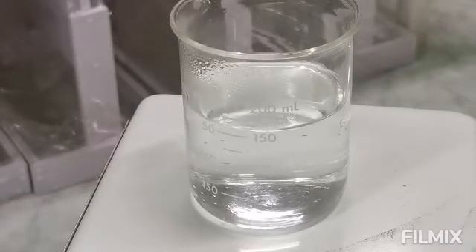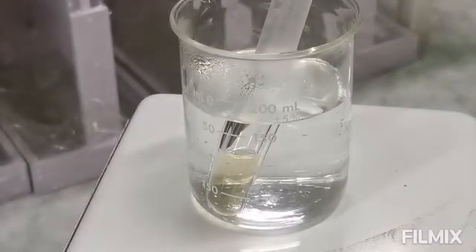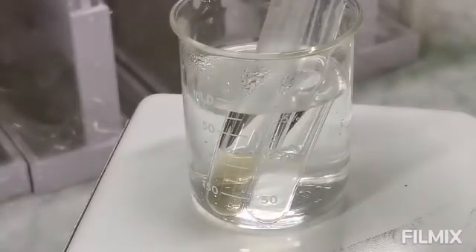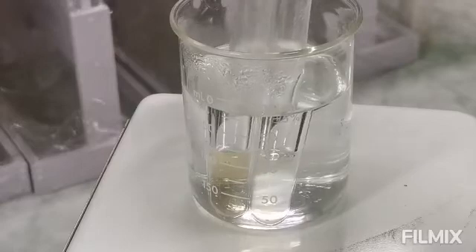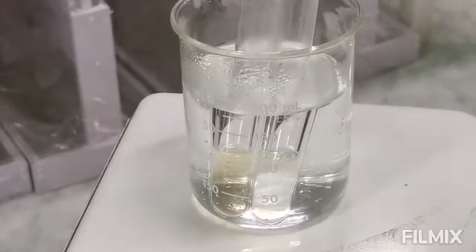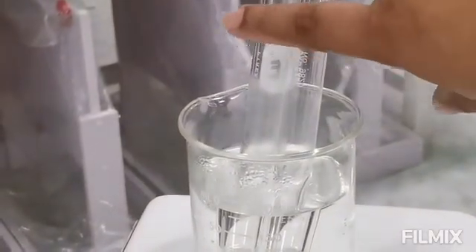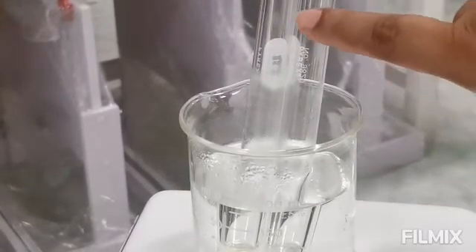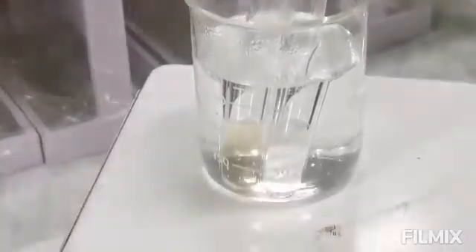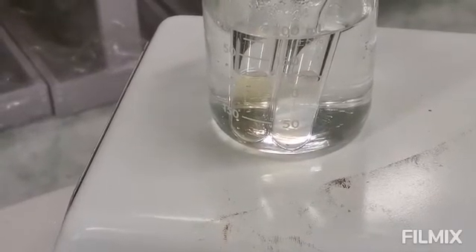So again, this is your meat extract. We will place that here, and then this is your egg albumin, and we will also follow the same procedure. So take note, this one is for your meat extract, and this one is for your albumin. You observe what is happening while it is heated.